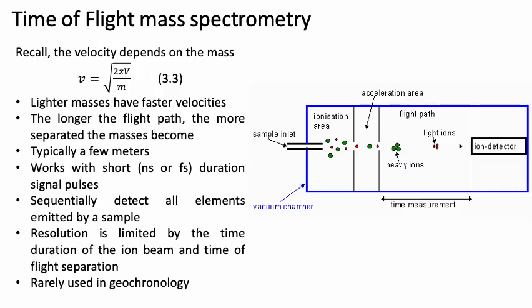So oftentimes these mass spectrometers, there's one in the chemistry building. It's huge. It takes up like 2 of these tables. So it's like 2.5 meters long. 2 to 3 meters is a normal length for these.